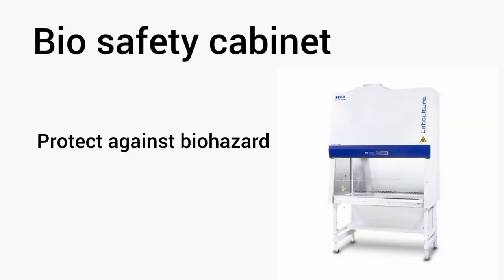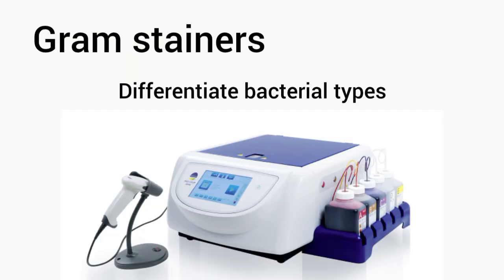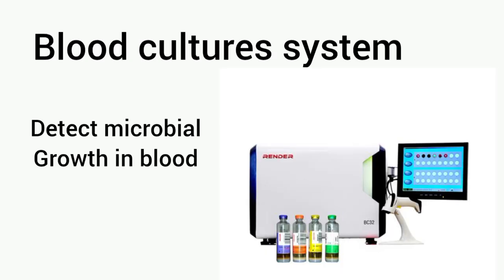Biosafety cabinet. It is used to protect from biohazards. Microplate reader. It is used for analyzing assays in 96 well plates. Gram stainers is used for differentiating bacterial types. Blood culture system, used for detecting microbial growth in blood.